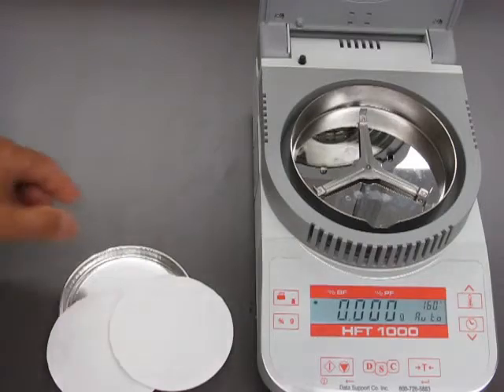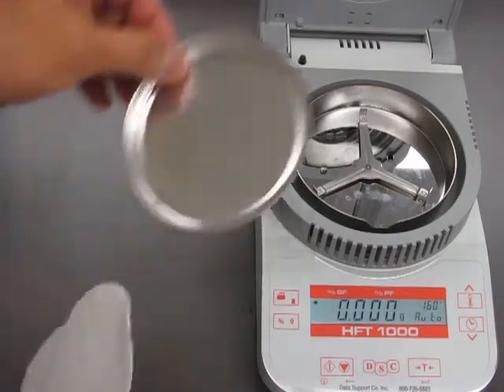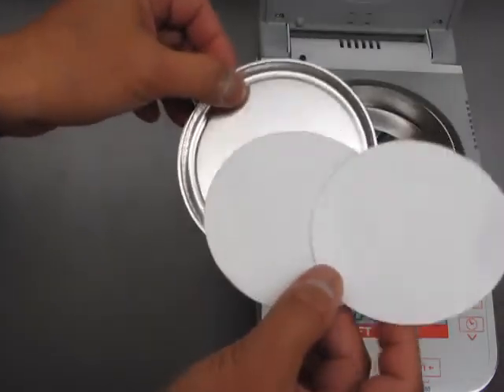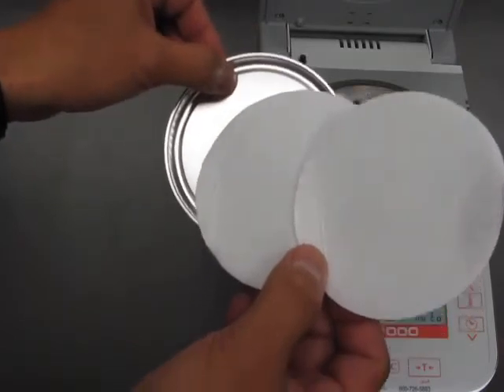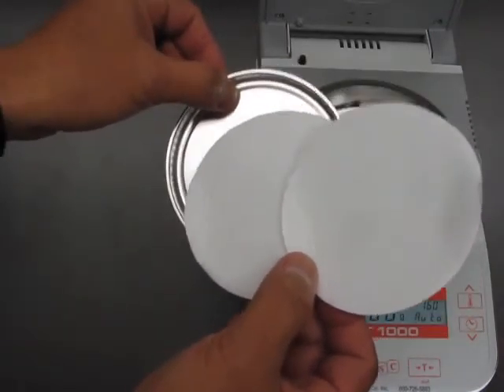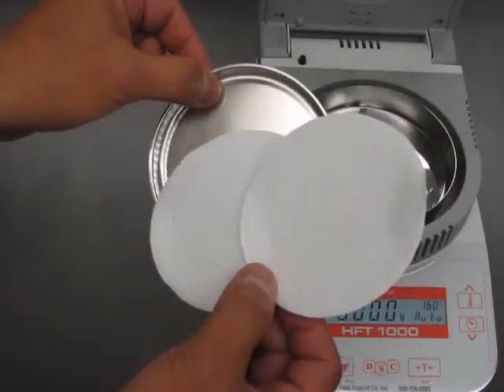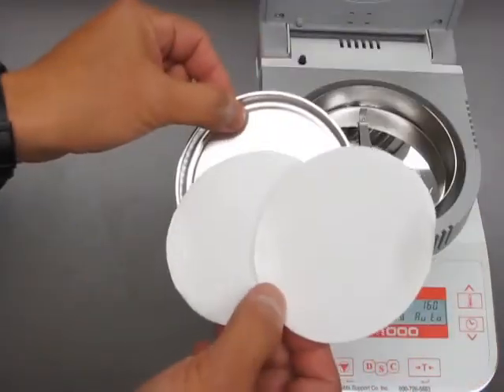The first thing you'll be needing is one aluminum dish and two pads. These should be clean aluminum dish and pads, unused, so every time you're done with the test, you discard them. These are consumables.